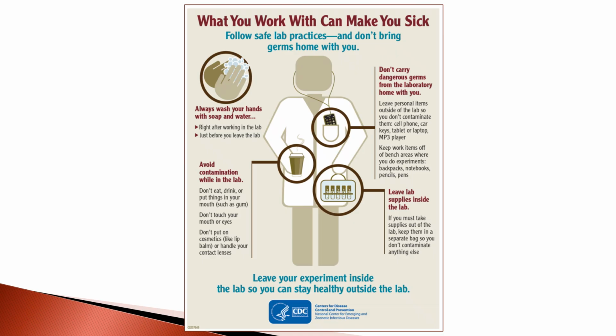Keep work items off the bench area when you do experiments. So your backpacks, your notebooks, your pencils, your pens, all those kind of things can't be sitting up there on that lab bench where you're working, and you leave your lab supplies inside of the lab. So you leave everything that belongs to the lab in the lab. You don't get to take anything home with you. And so you don't take your lab coat home with you. You don't do any of that. You leave all of that there. So leave your experiment inside the lab so you can stay healthy outside of the lab.